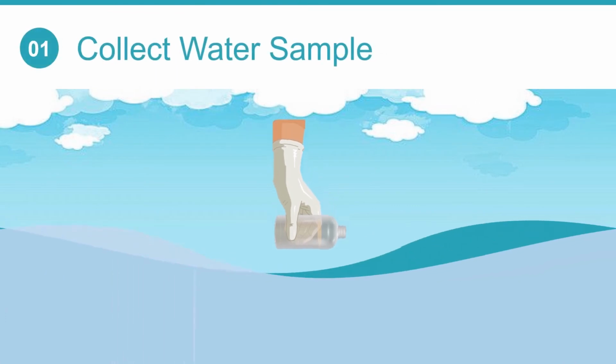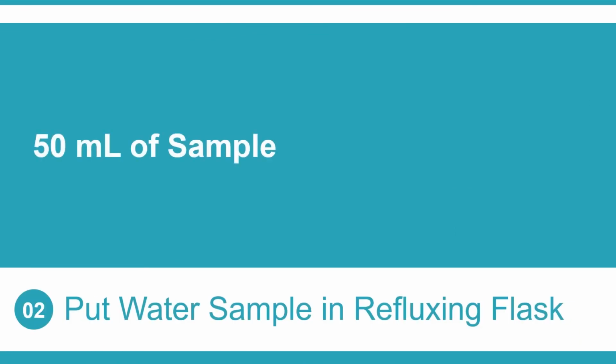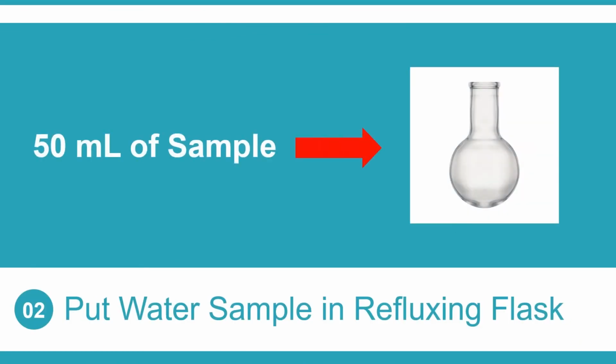First, we need to collect some water samples. In this experiment, the water samples that we collected were from the Baran lab and Redact lab in our campus. Then we transfer 50 ml of the water sample into a refluxing flask.